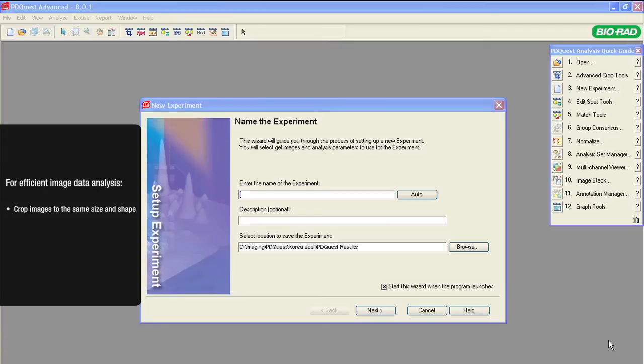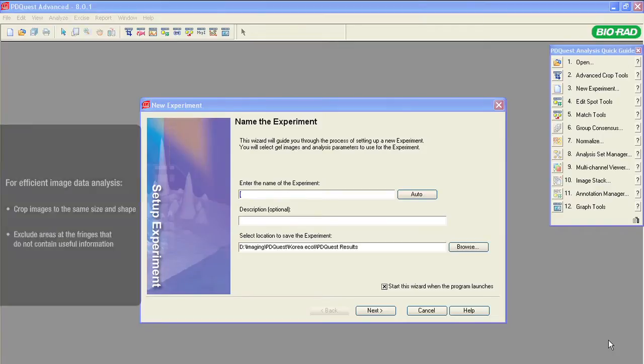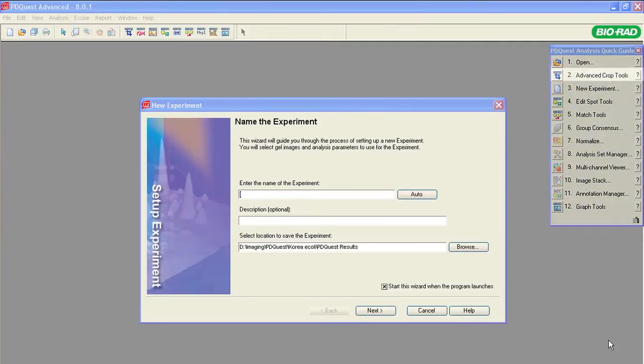Also, to improve efficiency, you may want to exclude the areas at the fringes that do not contain any useful information. Use the advanced crop tools to crop the images to the same size.